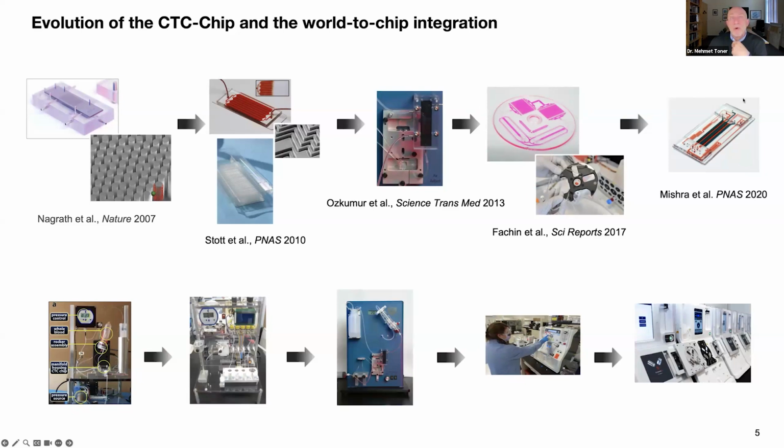And then more recently, we went to what I call microfluidics on steroids, where we can sort cells at 300 million cells per second. And we can process up to 1 liter of blood, and I will talk about that next. Our processors, which started as devices built in the lab, have become more and more sophisticated and fully automated now, where we can train a technician within a day to run these devices.